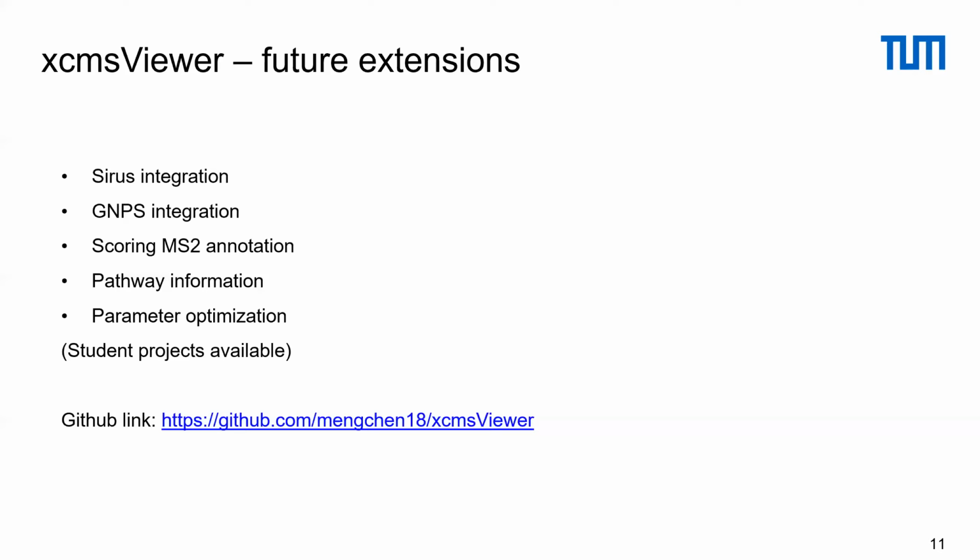So this is quite nice. But I would also say it would require some work to make XCMS Viewer compatible with GCMS data. I think in the future, if we need, we can check some GCMS data. And of course, if you are interested in developing it yourself, you are welcome. You're also welcome to contact me, and we can see how we can do this. Does this answer your question, Manfred?